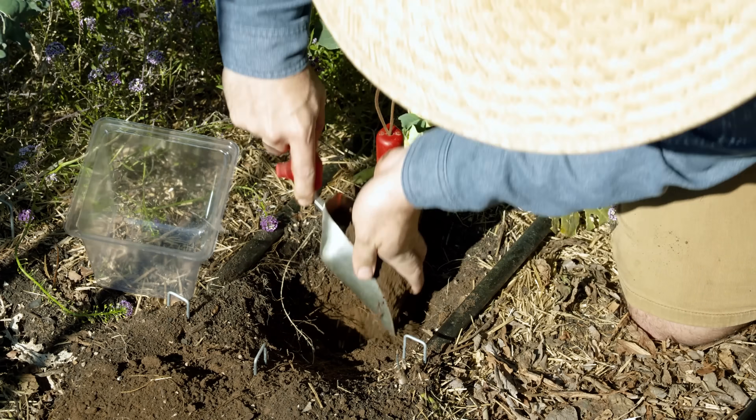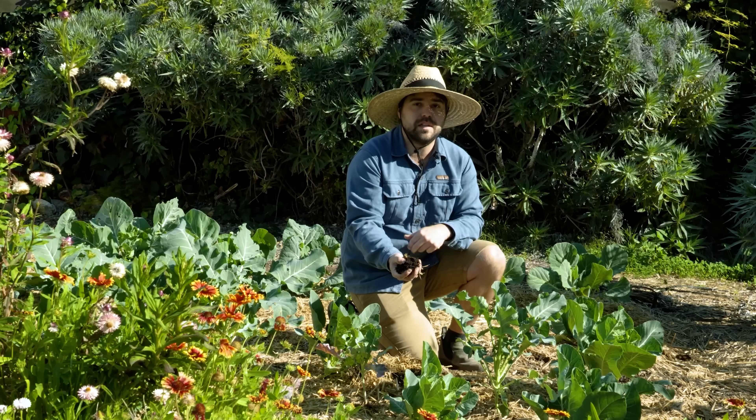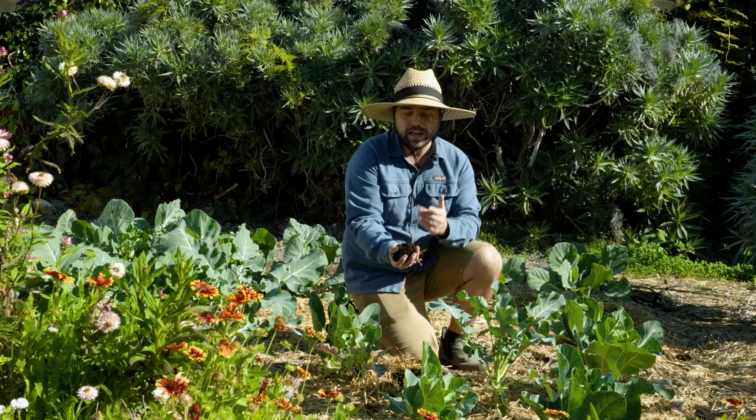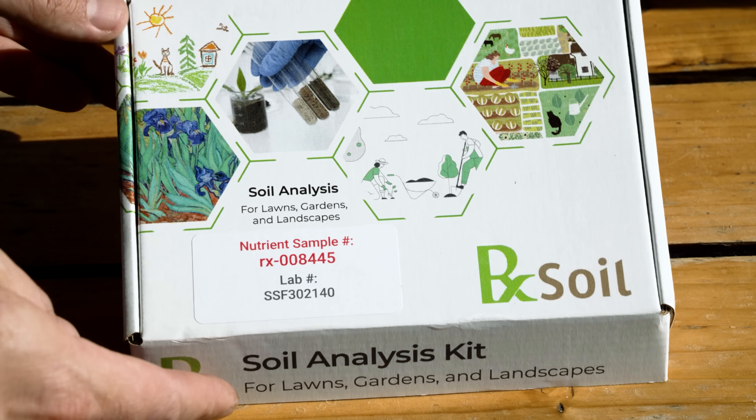So today we're going to be doing a soil test and actually looking at the results in the end once I send them to the lab. First let's go over exactly what the soil test is going to look at and how to collect your samples. The soil test I'm going to be using in this video is from RxSoil, and the reason why I chose this test in particular is because it includes soil organic matter content and cation exchange capacity.